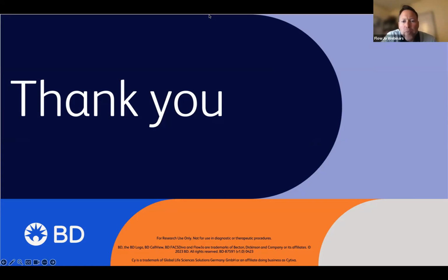I have a question here that says, I hope you will explain how to make UMAP plots. I try but could not plot my data. Your help would be appreciated. So taking a note, at the end, we will remove some bubbles, or at least data affected by bubbles, and UMAP some stuff up. I do not have that planned, but it's an easy thing to add in. It's like a click of a button. And I think the only trick to the UMAP bit is, make sure you've got the UMAP, which is done as a plugin. t-SNE's built in. So download the plugin for UMAP. And then there's a couple of choices to make. And I don't think they're overly critical, but we can talk about that.